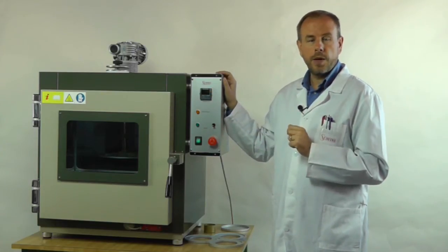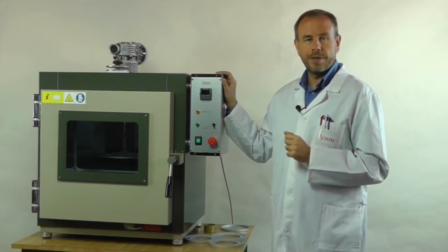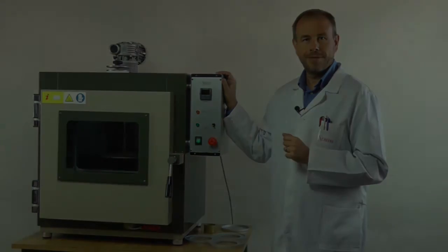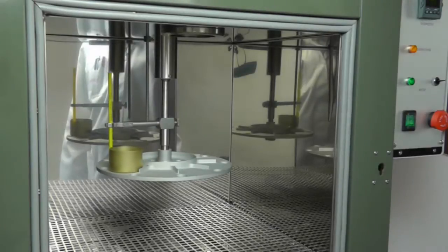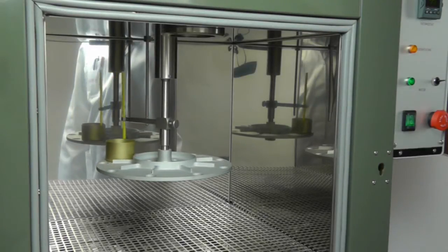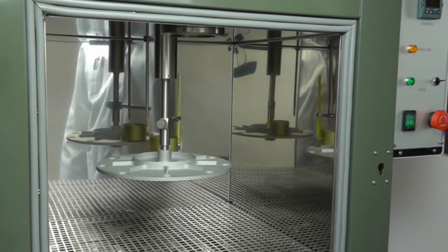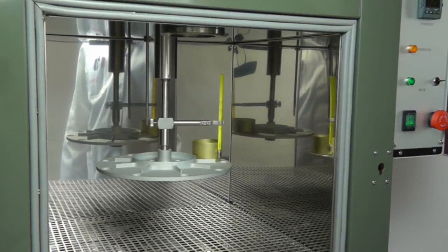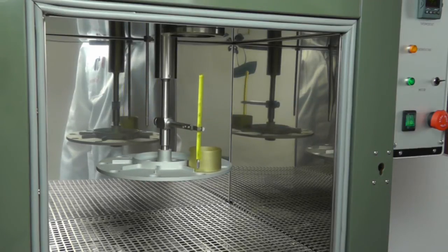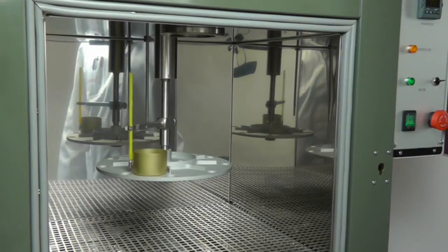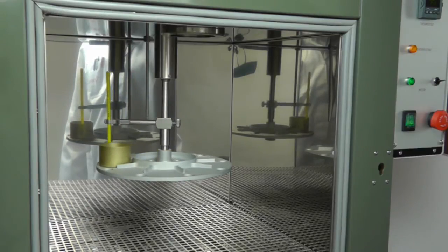But now let's take a look to the inside of the oven. So here we are. This is the inside of the oven with the ASTM D6 shelf in position and rotating. You can see also the sample container and the thermometer.